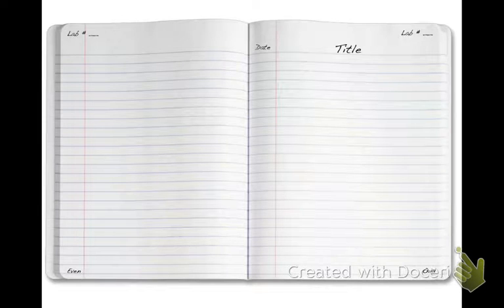I don't know if I can describe that. If you don't want to write anything in there, go ahead and draw a line and write your initials and your date in there. That way we know that it's not left, we know that it has been intentionally not used. Okay, so just one big line and your initials and the date. And then if you want to start your new lab on the right-hand side, you can do that. I personally prefer that just because it looks a little bit neater and more organized.